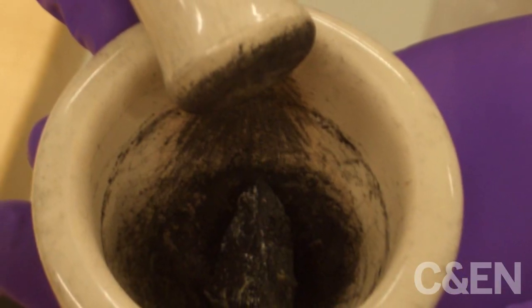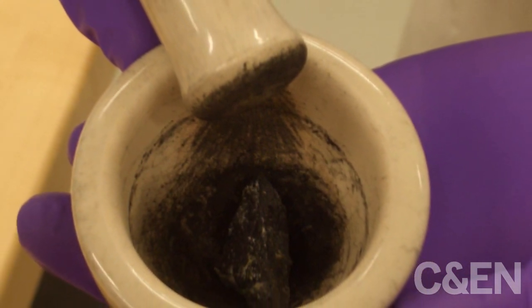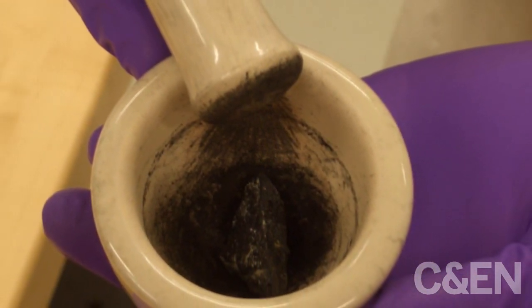We do that by taking a piece of the meteorite and crushing it up in a simple mortar and pestle to get the meteorite into a fine powder.